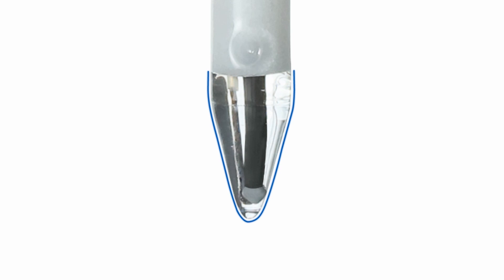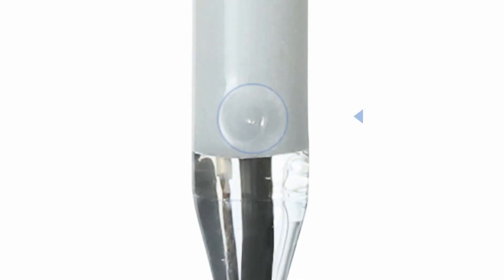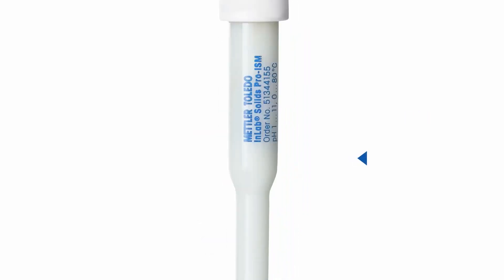This spear-shaped pH-sensitive membrane is made of LOT glass, which has a low resistance, leading to fast results. The electrode has an open junction, which avoids clogging and is easy to clean. Because of the solid zero-light polymer reference electrolyte system, the sensor interacts with the sample through diffusing ions, hence eliminating the difficulties associated with immiscibility of aqueous reference electrolyte with the sample.